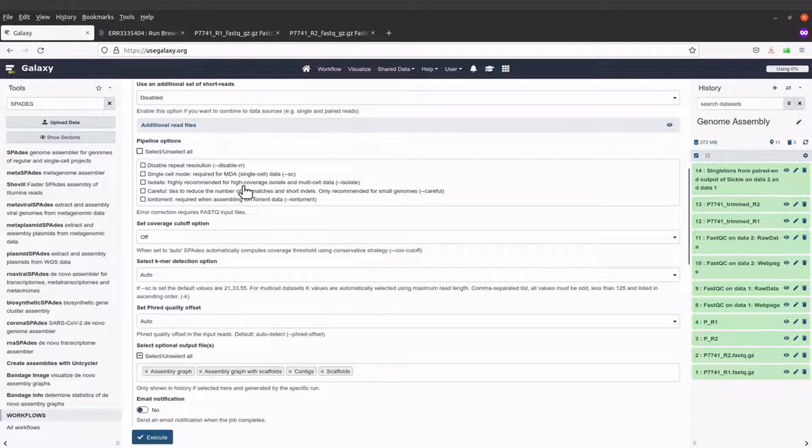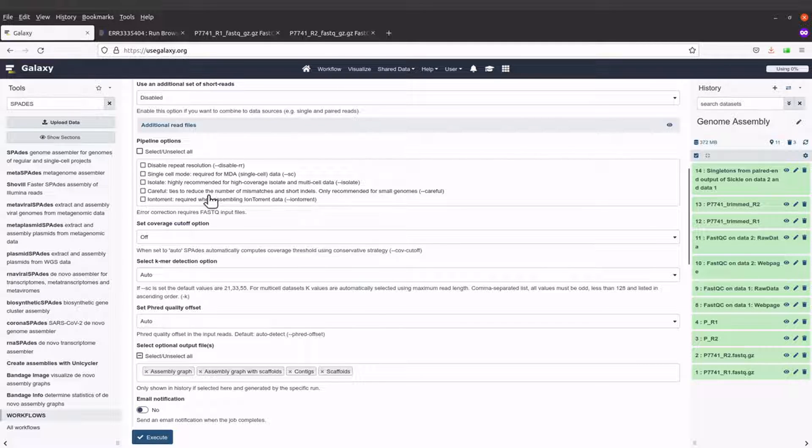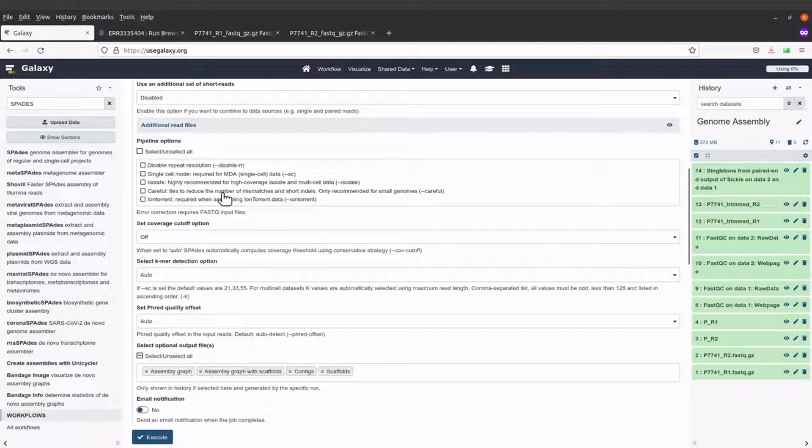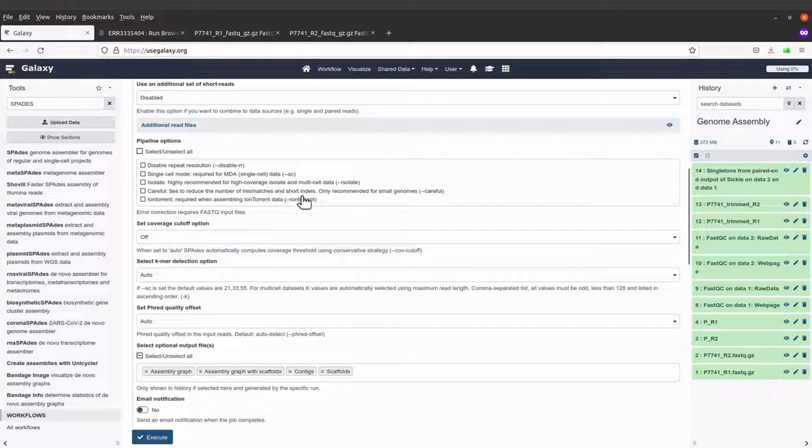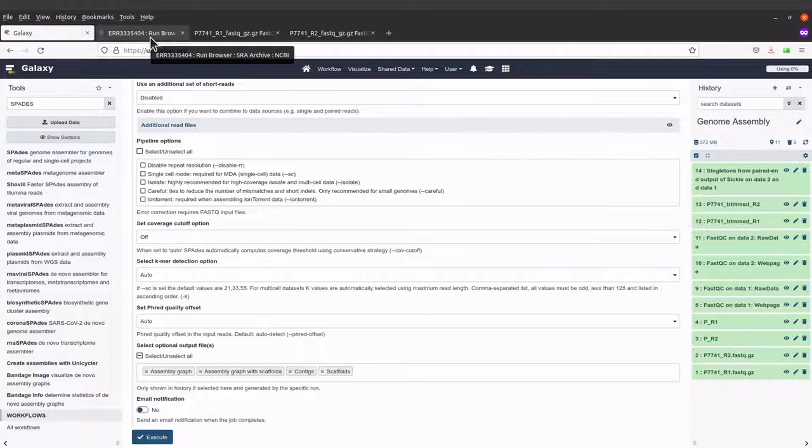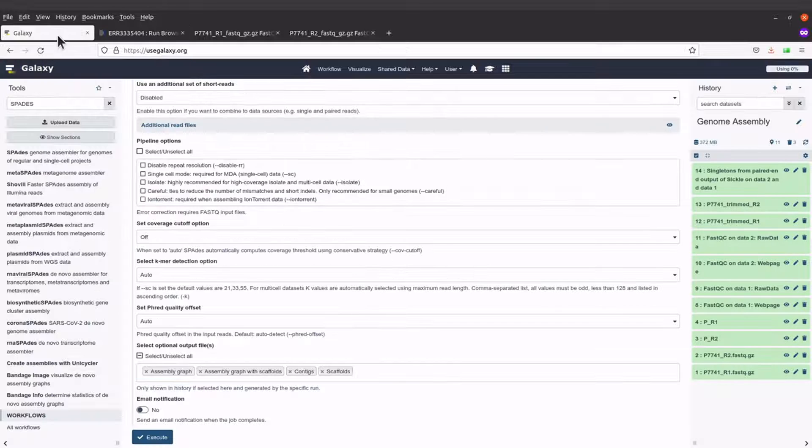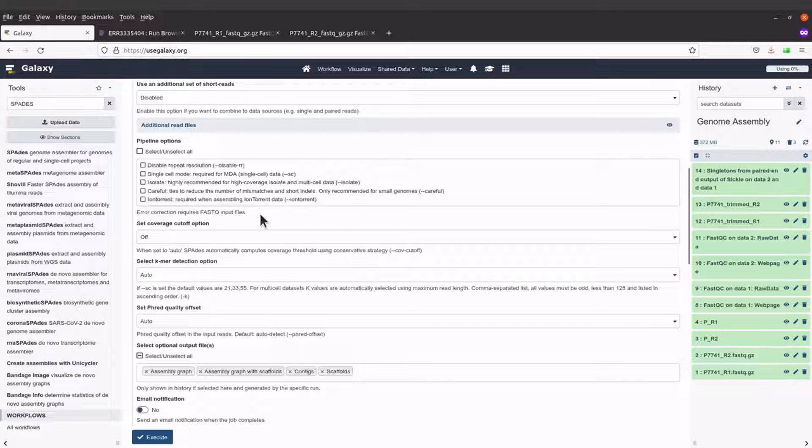We have isolates, which is highly recommended for high coverage isolated multi-cell data. You also have careful, which tries to reduce the number of mismatches and is recommended for small genomes. The data we are using is Mycobacterium abscessus isolates, which is small.